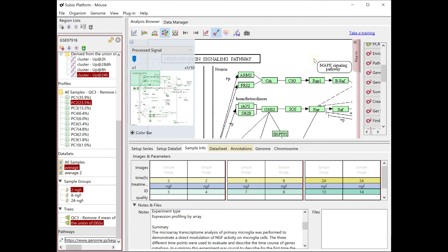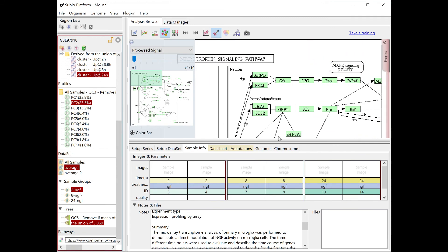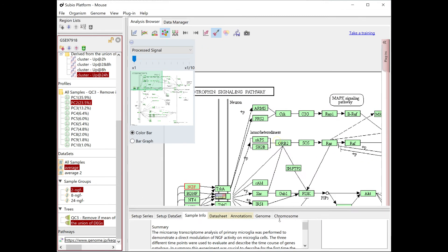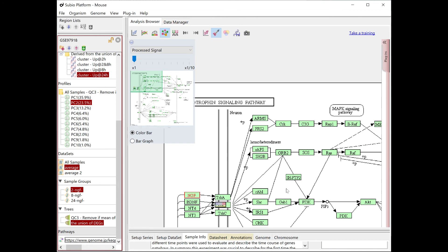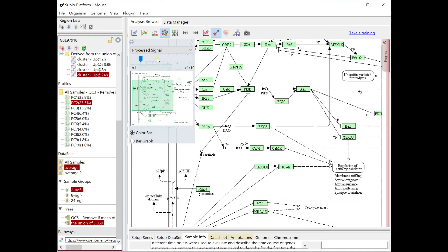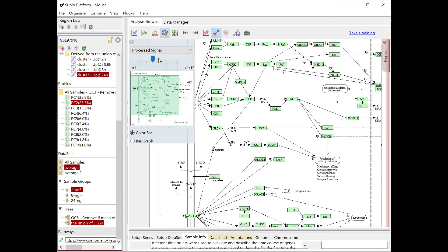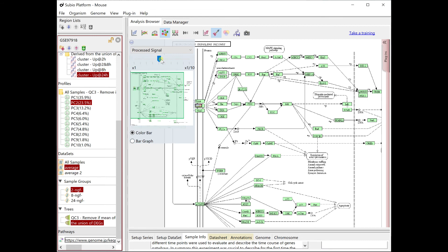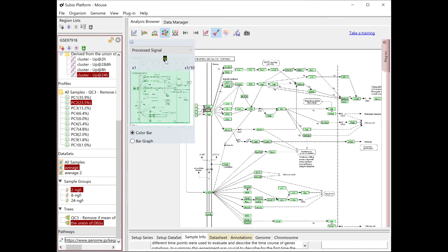The neurotrophin signaling pathway also seems to have a topological bias by the time course. Please see the details by yourself.